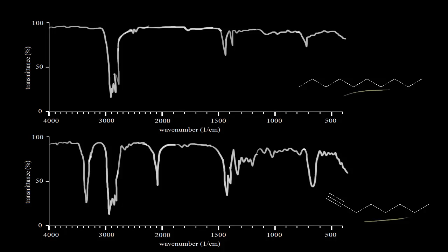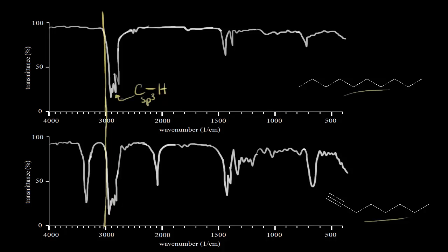One helpful thing to do is draw a line around 3,000 wave numbers on both spectra. We know that a carbon-hydrogen bond where the carbon is sp-3 hybridized shows up under 3,000. So that's what we're looking at in this region — it's not really worth analyzing in great detail, but under 3,000 is where you expect to find your sp-3 C-H signal.